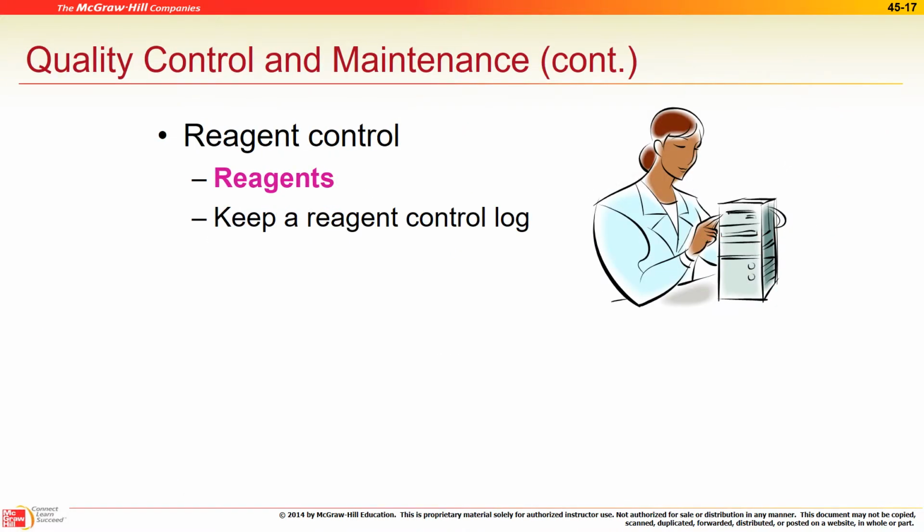Reagents. So these are your chemicals. They expire as well, especially your standards. Your standards are good for about a year after you open them. Your other chemicals, same thing, a year or two, and then you have to throw them out. They might change or lose their effectiveness.